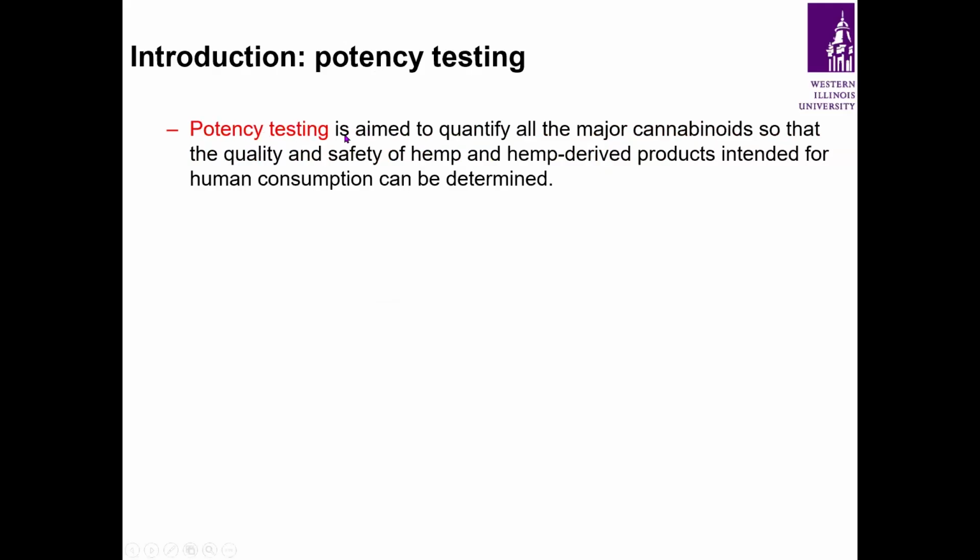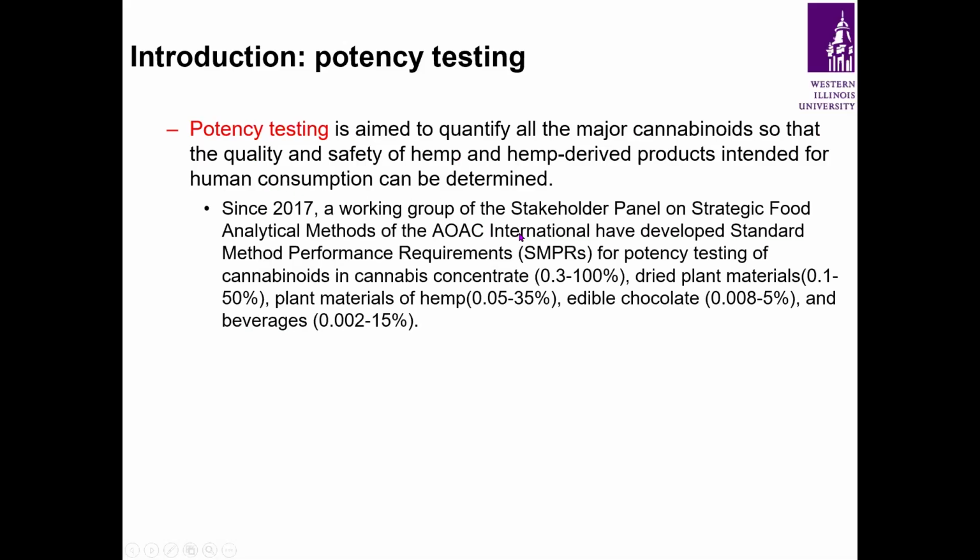Potency testing is aimed to quantify all the major cannabinoids so that the quality and safety of hemp and hemp-derived products intended for human consumption can be determined.